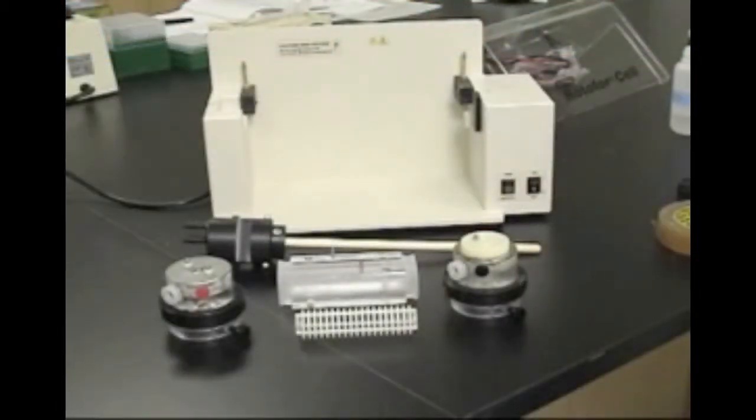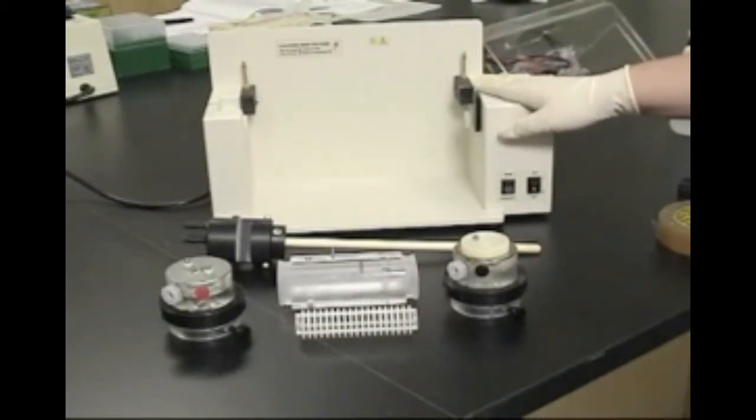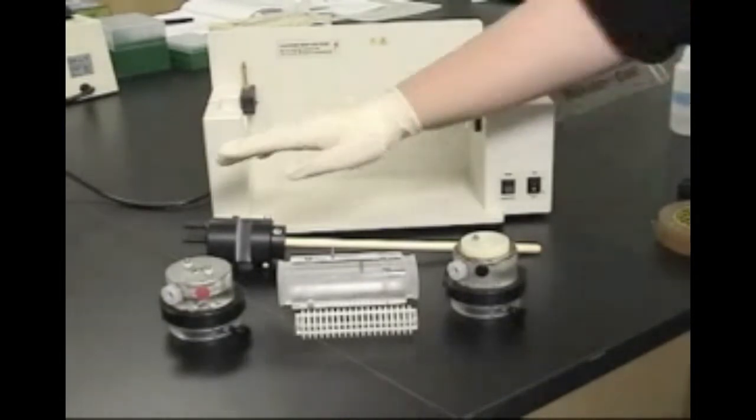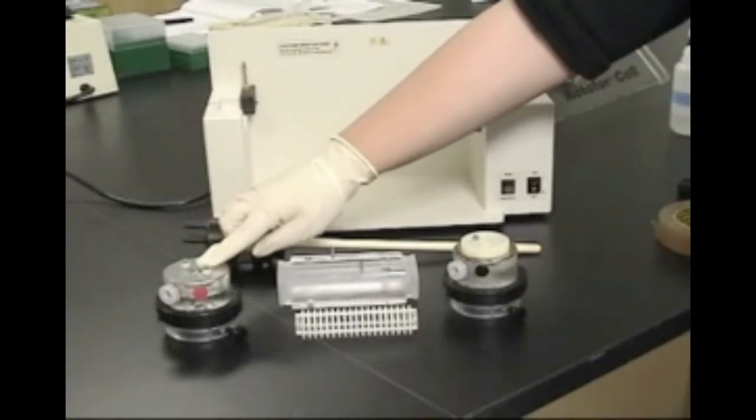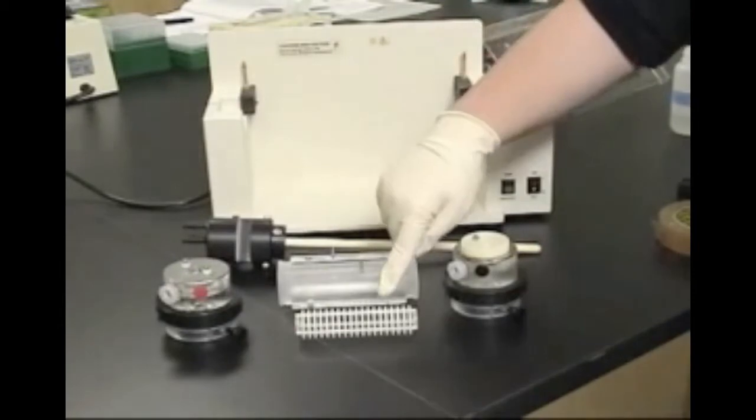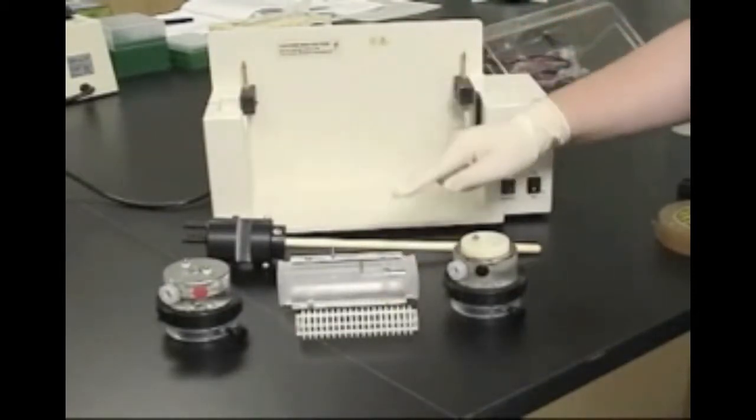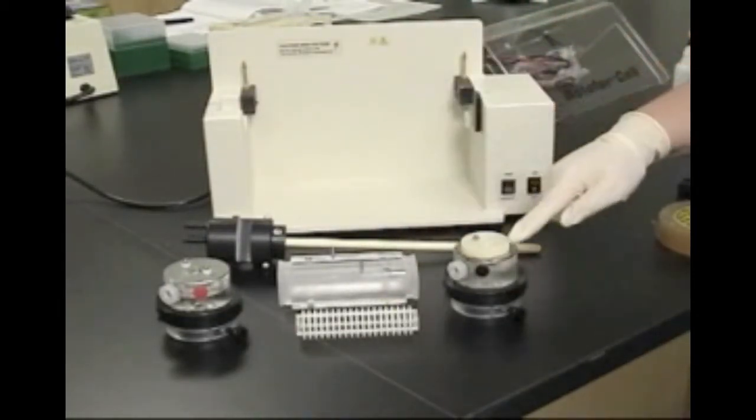Now we will assemble both electrode chambers and the focusing chamber onto the cooling finger and onto the chassis. The anode chamber will be placed first, followed by the membrane core, the focusing chamber, and finally the cathode chamber.